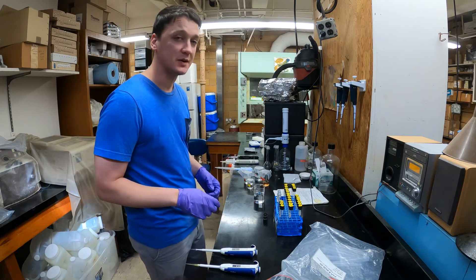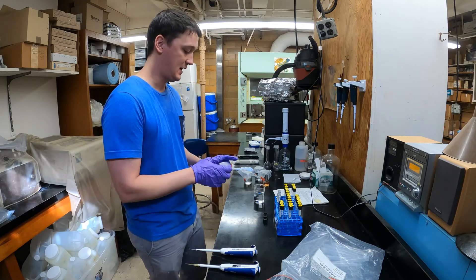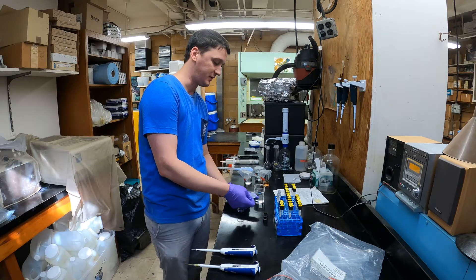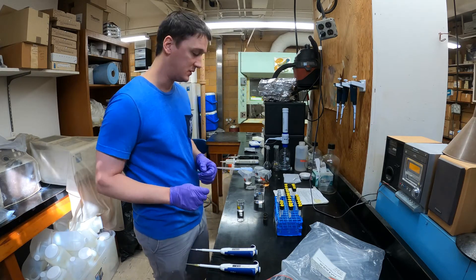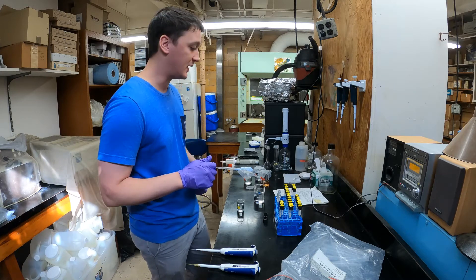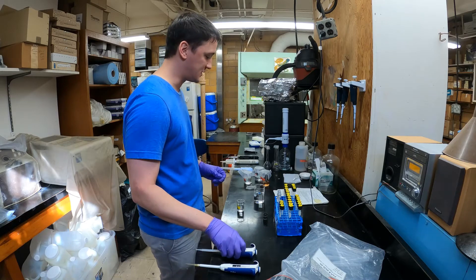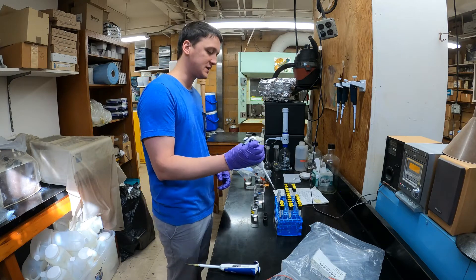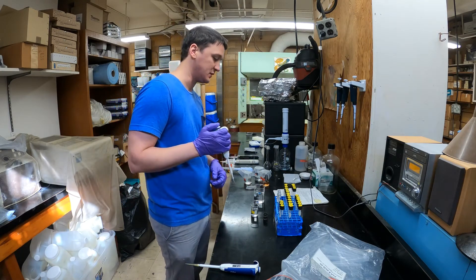Now I'm going to start with the standard curve. I've got an ammonium stock solution and I'm going to add a small amount to these test tubes, then fill them up with 10 milliliters of ultra-pure water — a very highly purified water from our lab, kind of like a double DI system. I'm going to add a specific amount of stock solution to three test tubes and do these in triplicate.